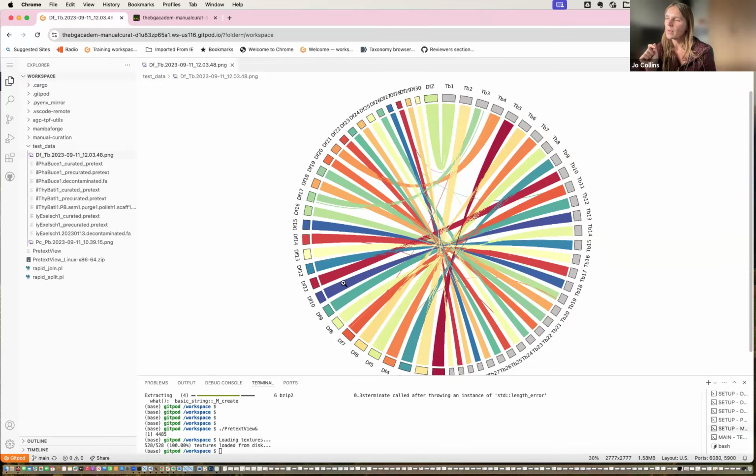This is where we have a script that we can use in-house to identify a close comparator, or you can go in via the NCBI taxonomy browser, take your specimen and find something that's a close relative, and then we would run an alignment to identify, in this case, our Z chromosome.